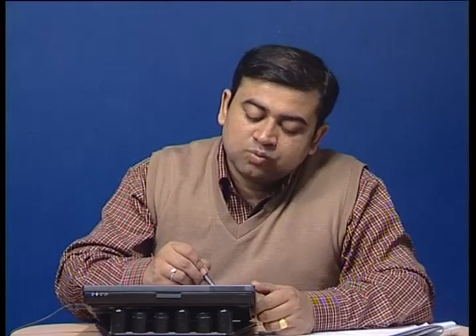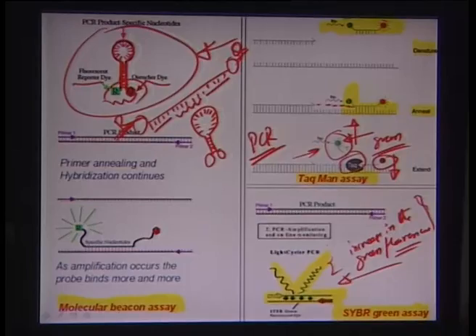As the hairpin loop is folded and these bonds develop, the reporter and the quencher molecules come close by, and therefore whatever is emitted by the reporter is essentially absorbed by the quencher molecule. The overall fluorescence level is low. Now what happens when it starts binding?